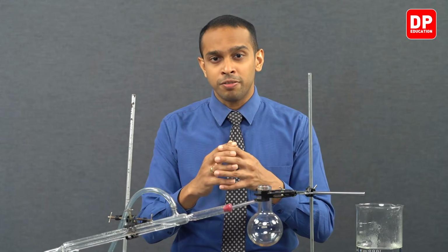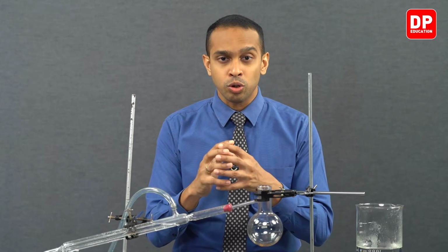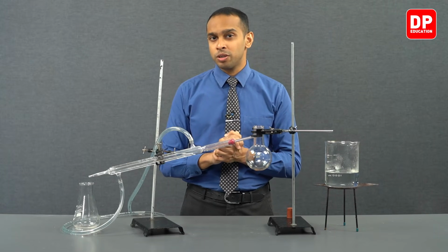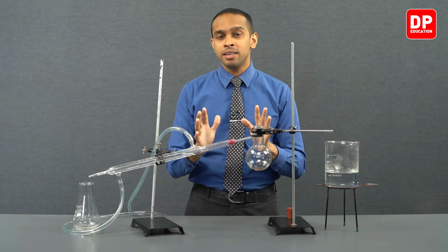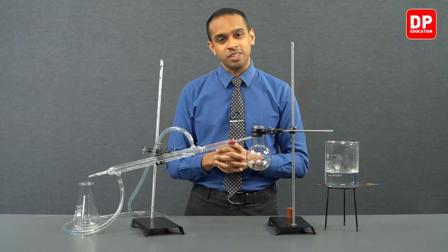Rather than sodium sulfate being mixed throughout the mixture, you will see the formation of sodium sulfate clumps. If you do not observe the formation of any sodium sulfate clumps, this indicates that your diethyl ether layer is now free of trace amounts of water.